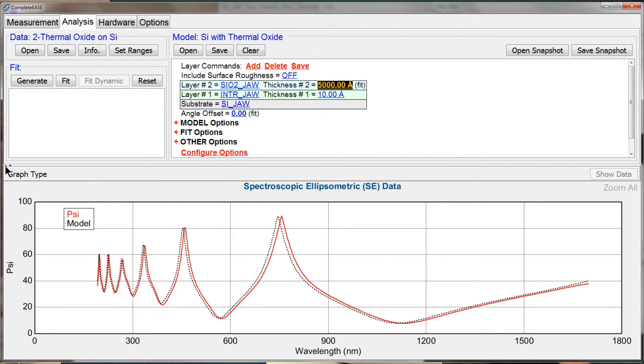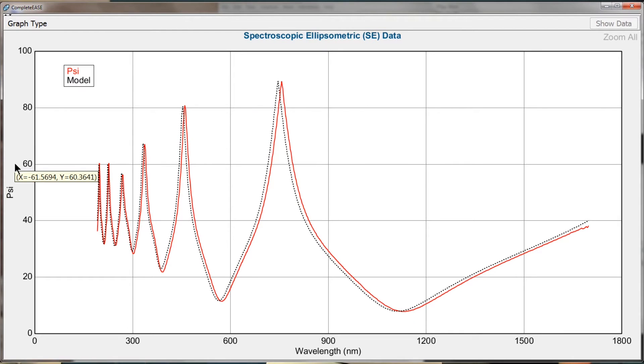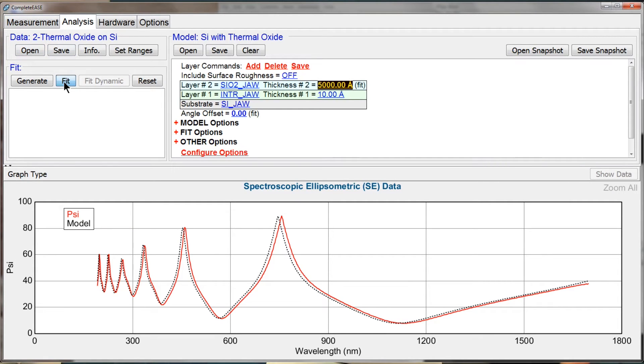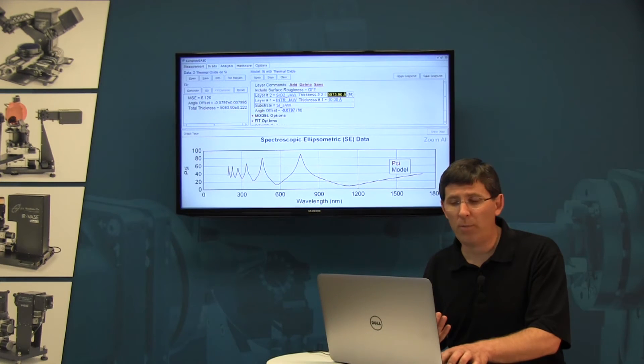I have the same number of peaks and the same number of valleys as my experimental measurement. That tells me that I'm pretty close to the correct answer. If I press fit, it should find that result.